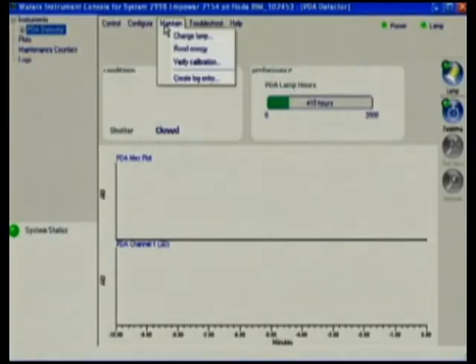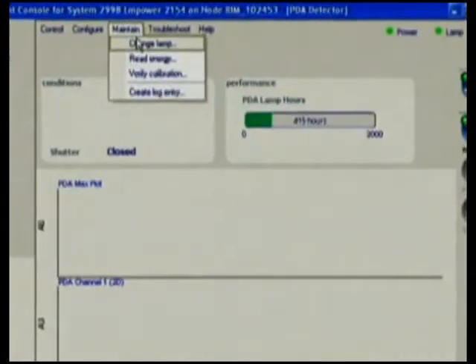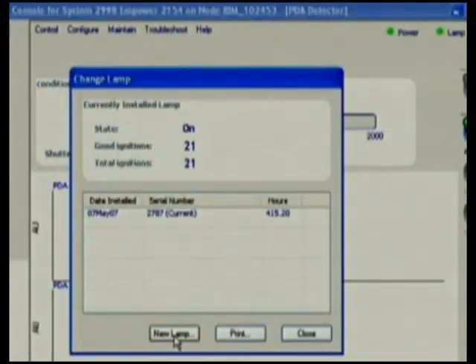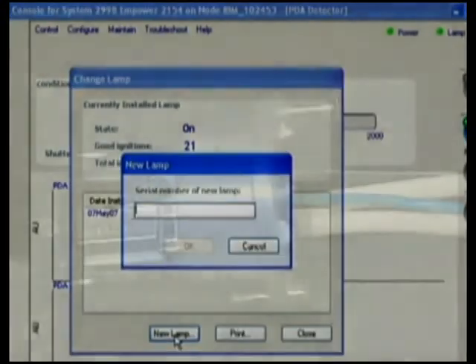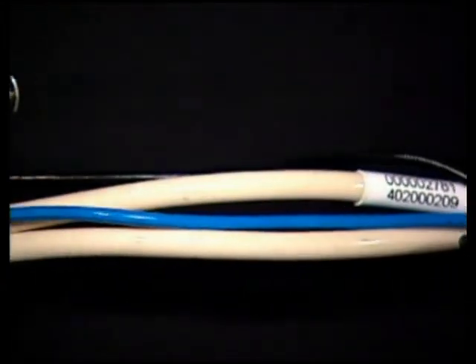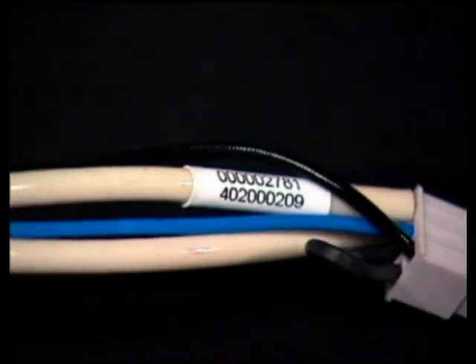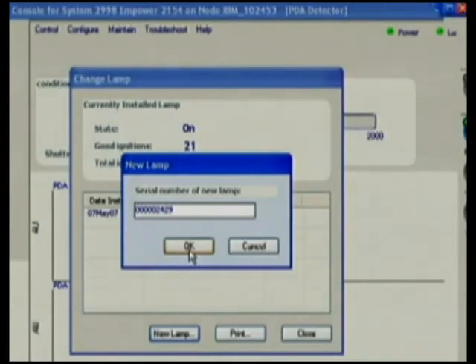From the console, select Maintain Change Lamp. Click New Lamp. Enter the 9-digit serial number for the new lamp. The serial number is found on the label attached to the lamp connector wire. Then click OK.